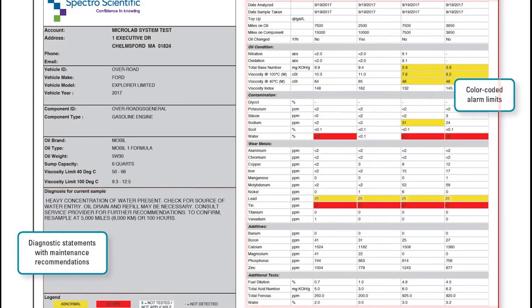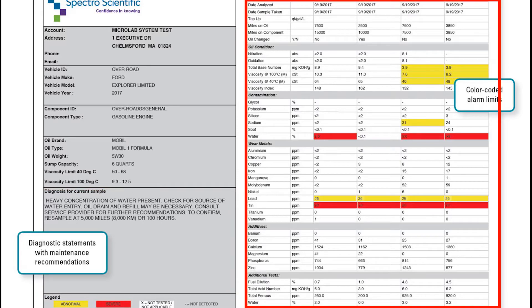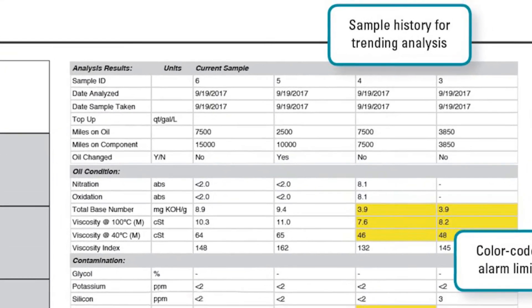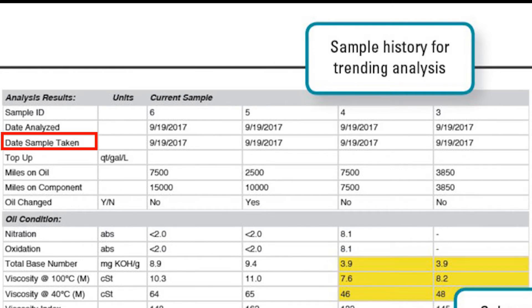On the right-hand side of the report are the results for the oil analysis. The top section gives information about the sample, such as the date it was taken, the date it was analyzed, the miles or time on the oil and component.